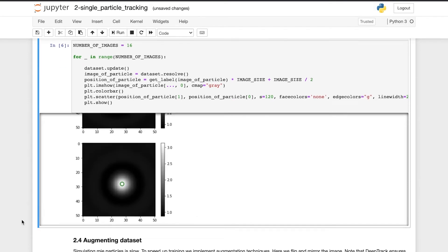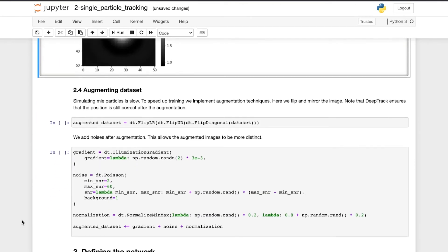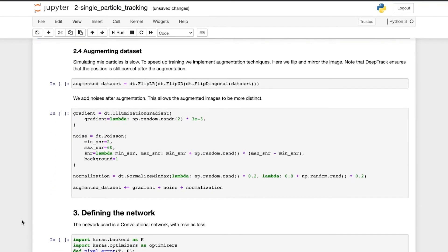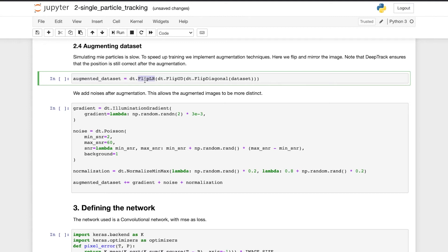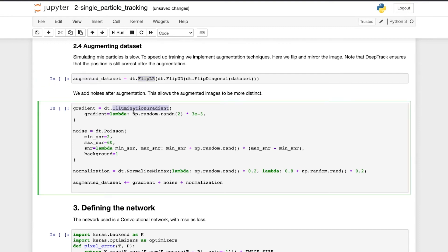Simulating Mie particles is slow. To speed up training, we implement augmentation techniques. Here we flip and mirror the images. Note that DeepTrack ensures that the position is still correct after the augmentation. To allow for more distinct augmented images, we add illumination gradient and noise to the images after the augmentation, as well as normalizing the images.